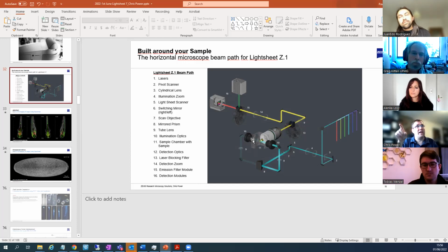On the light sheet, as you zoom in, so as you go from a 50x field of view to a 7x field of view, that adjustment is automatically done. So as you zoom into a 50x, your Z resolution does get slightly better, but it will tell you that in the software. Okay. Thanks.